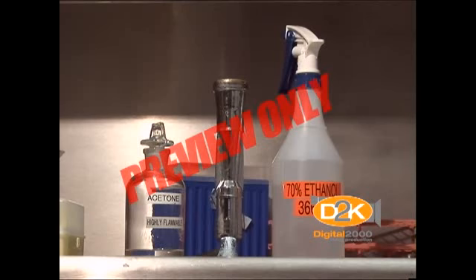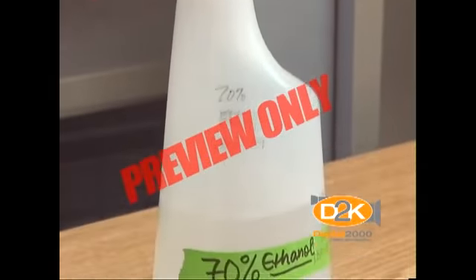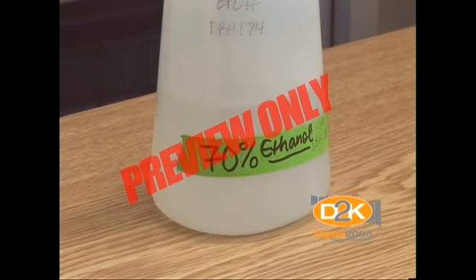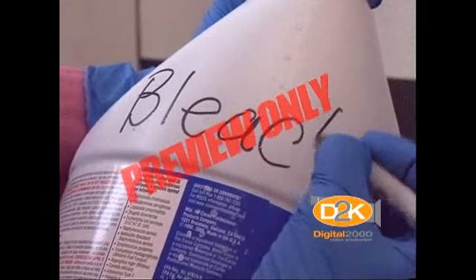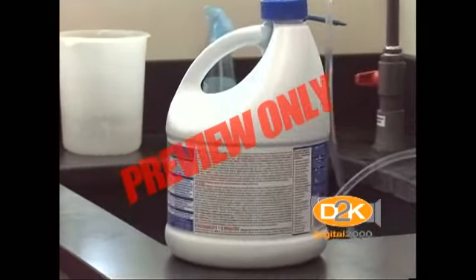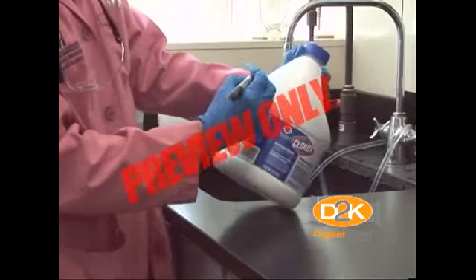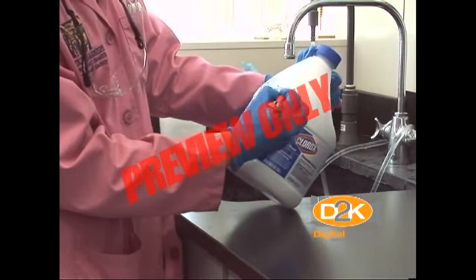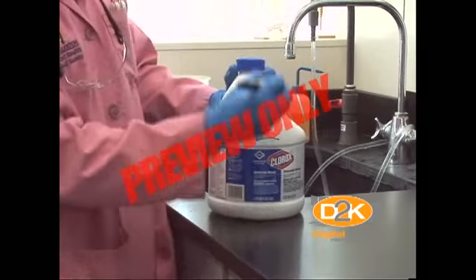Alcohols are used often as liquid disinfectants. The most commonly used alcohols are ethanol and isopropanol, and are most effective at concentrations of 70%. The most commonly used and generally effective disinfectant is sodium hypochlorite, commonly known as household bleach. 1% sodium hypochlorite is an appropriate disinfectant for a wide range of bacterial, excluding bacterial spores, and viral agents.